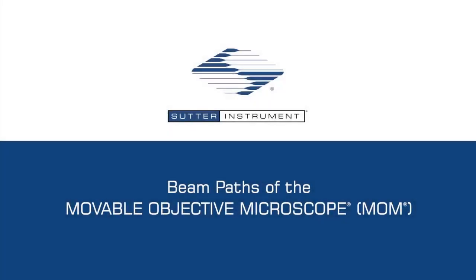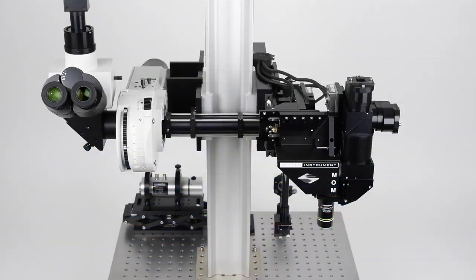This video highlights multiple beam path options in the Sutter Instrument Multiphoton Movable Objective Microscope. Please note that the table optics shown here have been simplified.